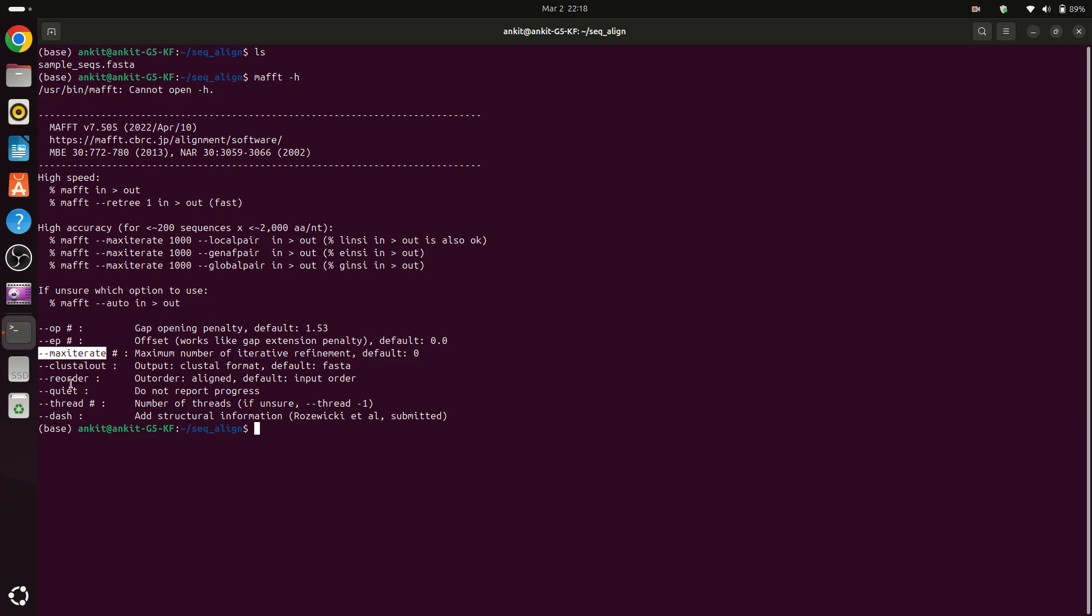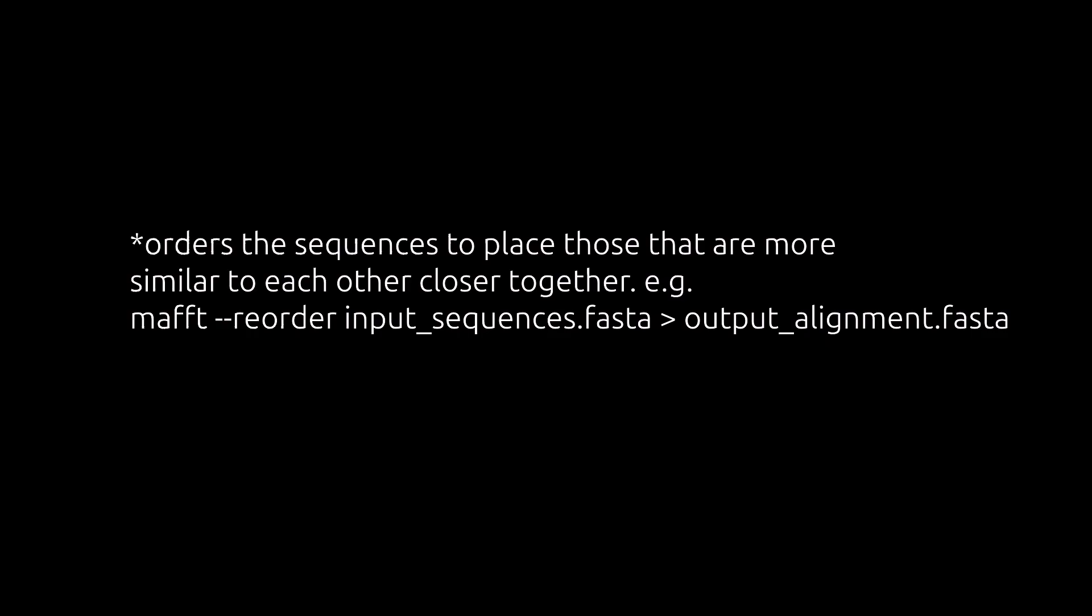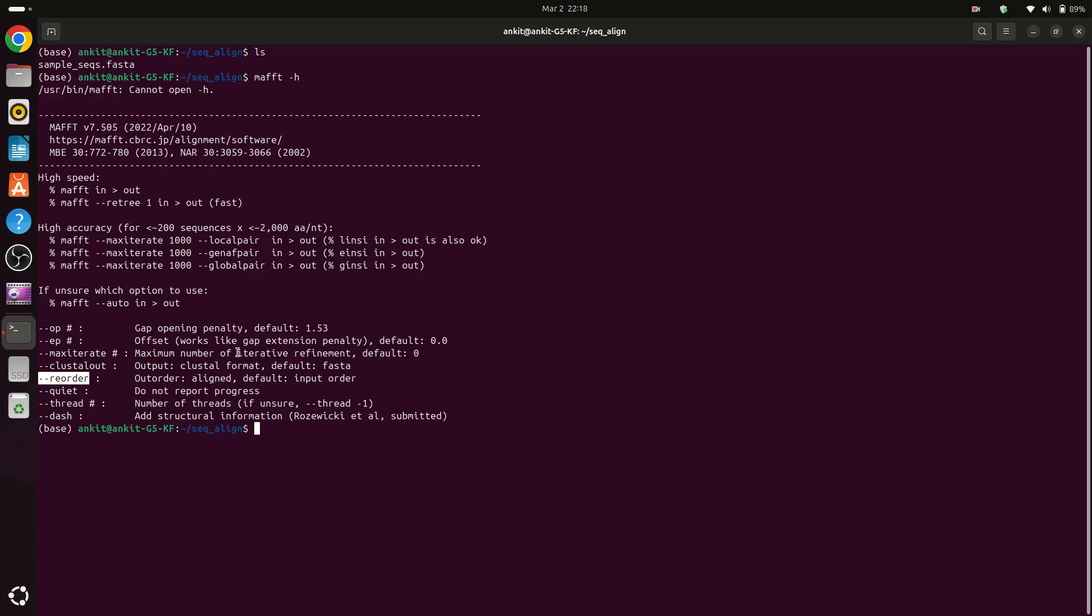And then we have a reorder option. So for example your FASTA file has now sequence one, two, three, four, but after alignment these files will be like sequence one, sequence nine, sequence 100. So if you want to reorder sequences from one, two, three, four into one, nine, ten, eleven, then you have to provide reorder option.